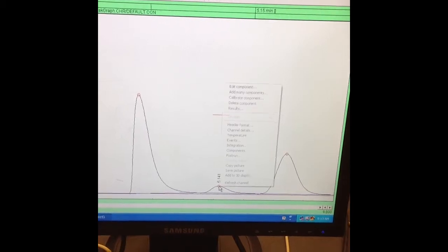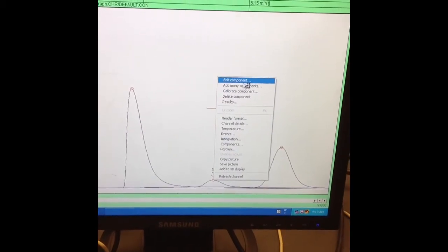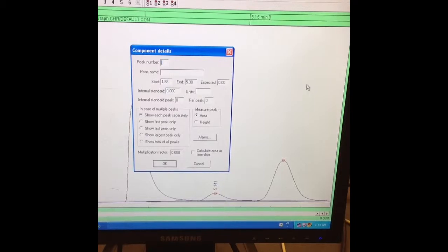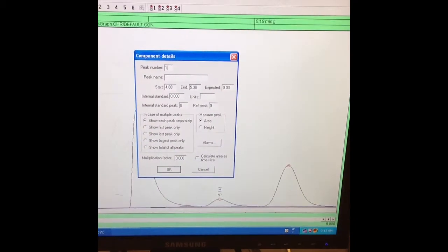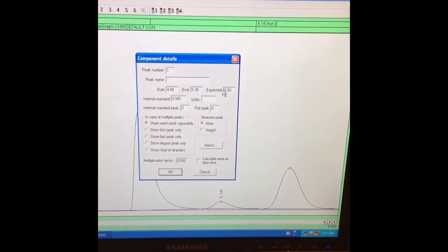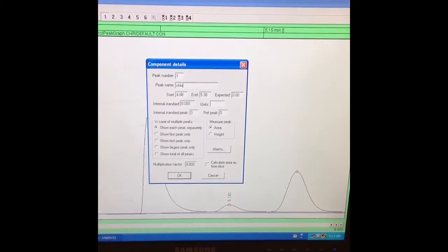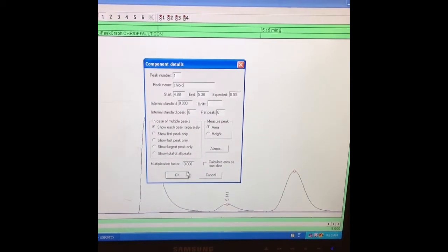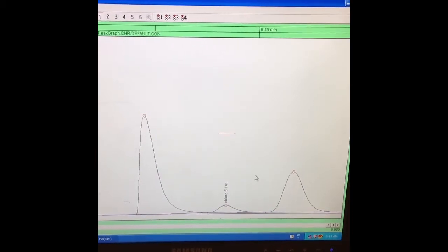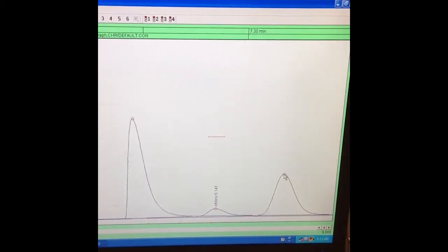So now I can title the chloro peak and the bromo peak, and we know these peaks based off of standard chloro and bromo peaks that we have. So I'm going to right click in that circle, I'm going to add a component, and then I'm going to right click again in that circle, I'm going to click on edit component. And I'll title this Peak 1 and the actual name I'll give it chloro. Click OK, and there you have that.